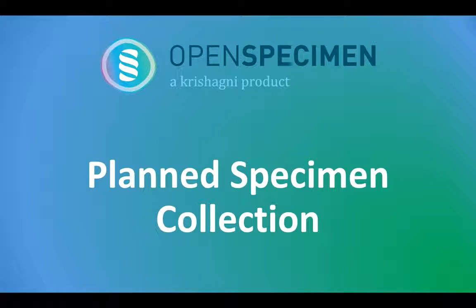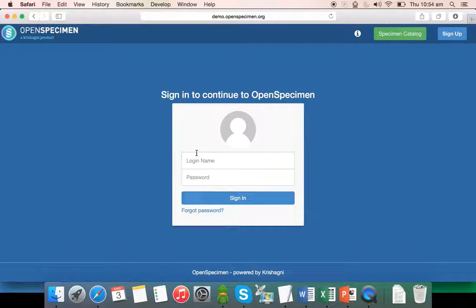This video demonstrates the planned specimen collection in OpenSpecimen. So first, log in with my account.